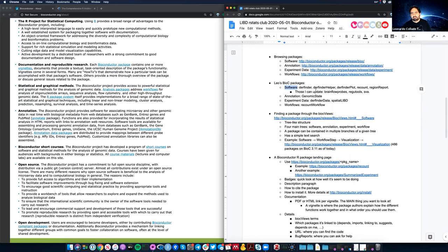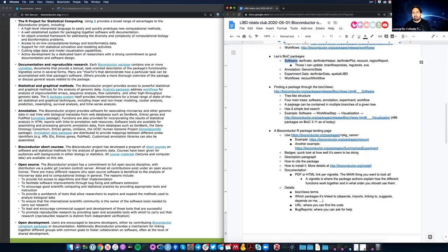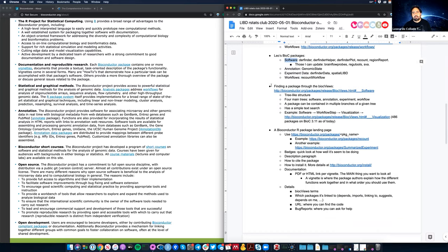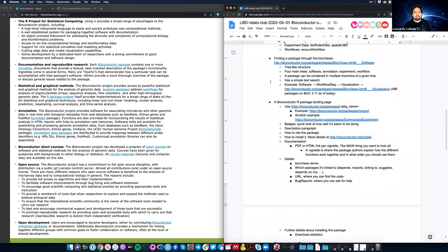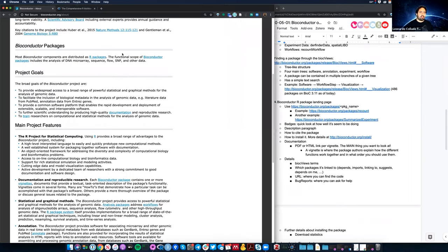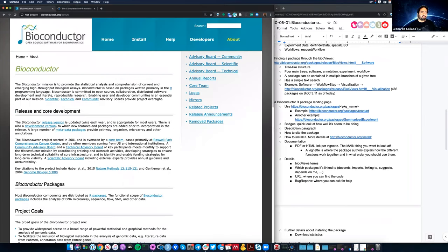I've made several packages — actually I've now made every type of package: software, annotation, experiment, and workflow. I started just doing software packages but have had to do the others as well. If you ever want to make any of them, I can help you. Now those lists are not really user-friendly to explore, so let's go back to the bioconductor.org website.